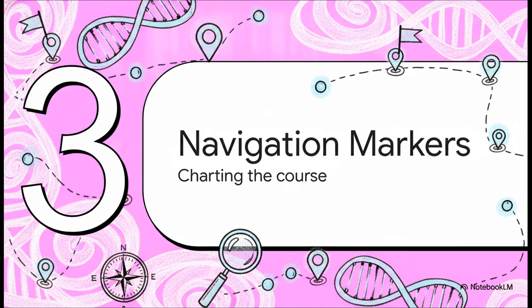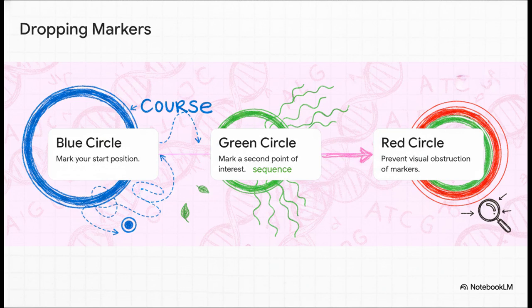Moving right along, Section 3, Using effective navigation markers. When you're dealing with a map this massive, knowing exactly how genome markers work effectively is absolutely crucial. It's the only way to avoid getting hopelessly lost. The software uses specific built-in pins to chart your course. First, you place a bold blue circle right at your starting position. Find another interesting sequence? Boom! Drop a green circle to mark that second point of interest.